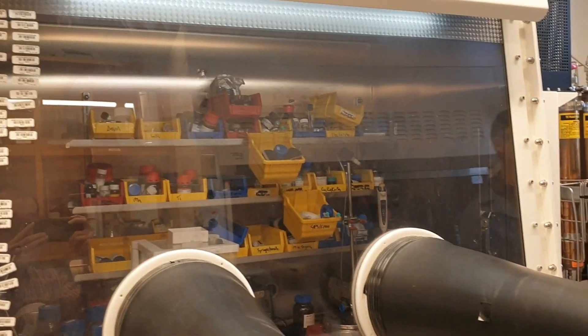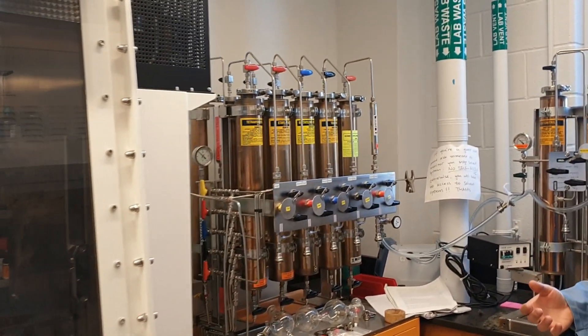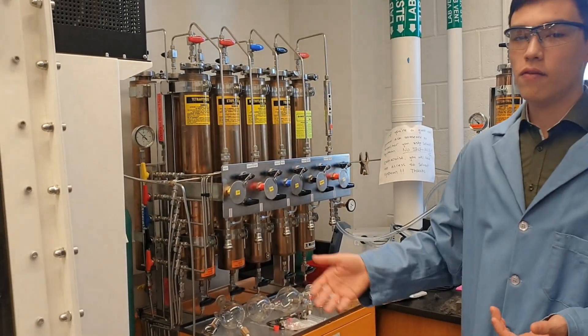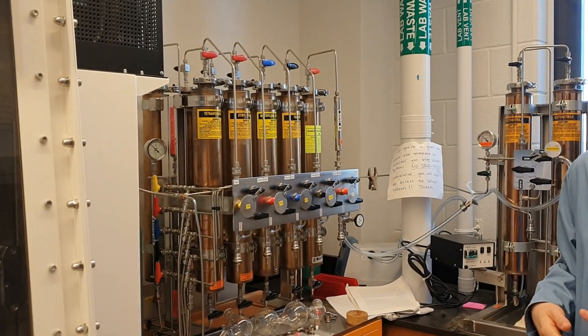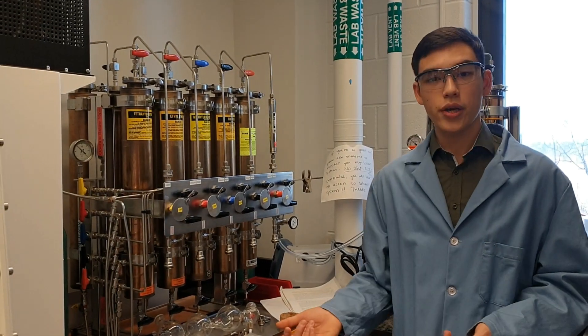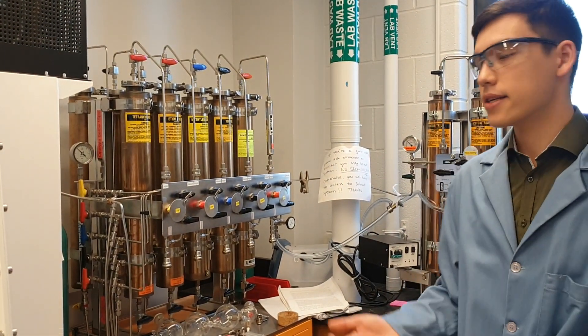Here you see our solvent system, which runs with argon. We have our typical solvents that you will use during everyday chemistry, such as THF, ether, methylene chloride, toluene, acetonitrile, and DMF.